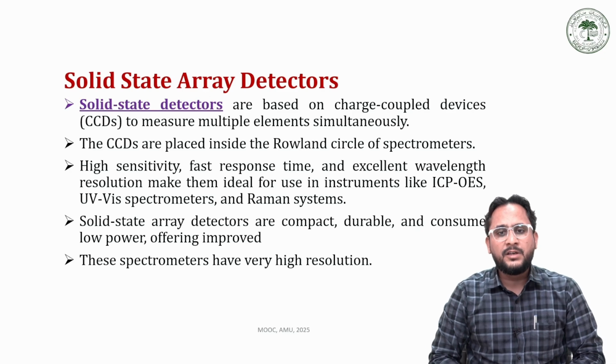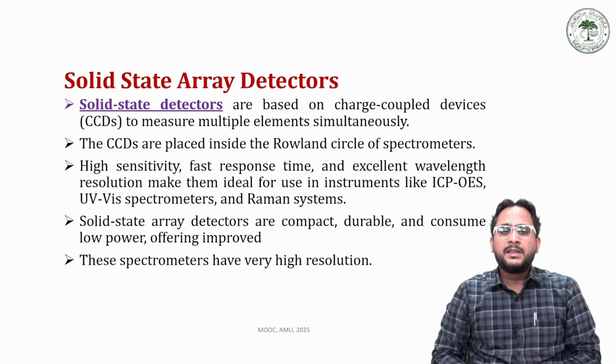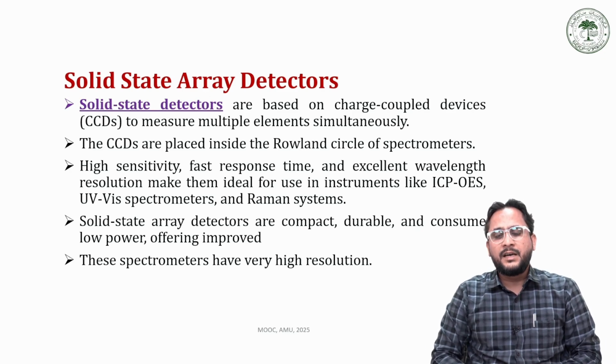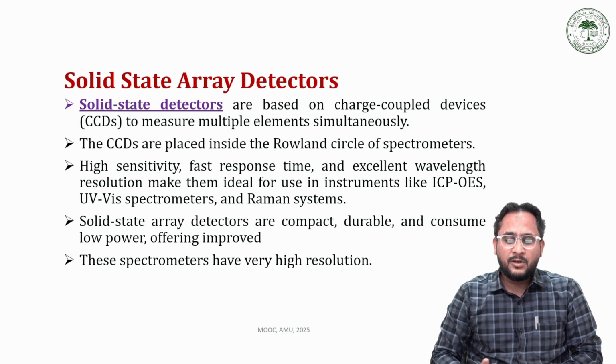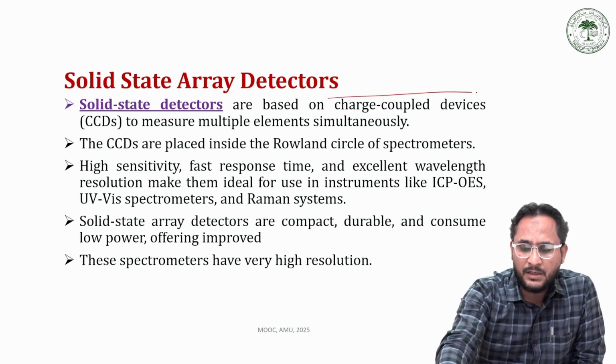In the case of these solid state array detectors, as I said, there are two types: one which uses charge coupled devices and the other which uses charge injection devices. We mostly prefer solid state array detectors that use charge coupled devices.